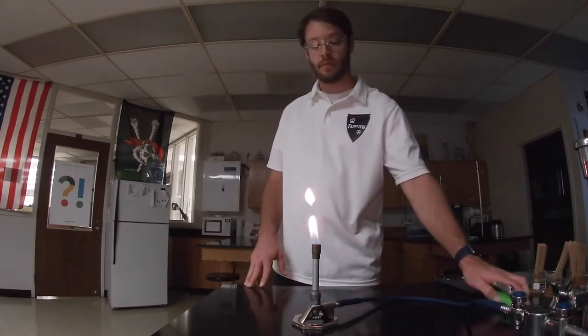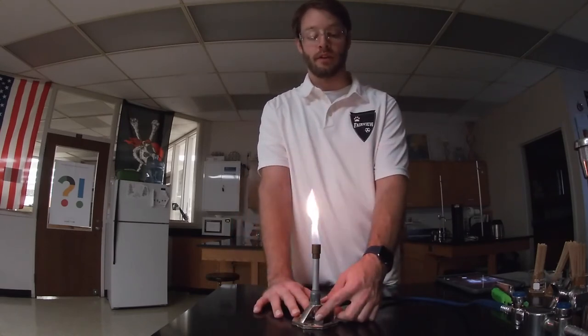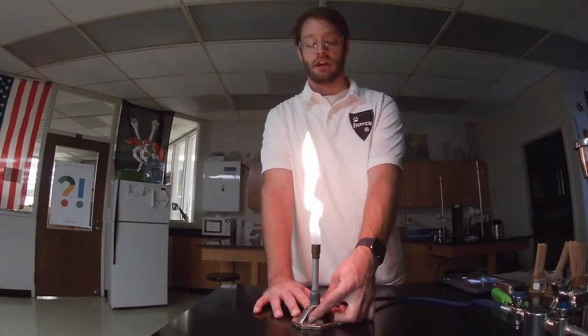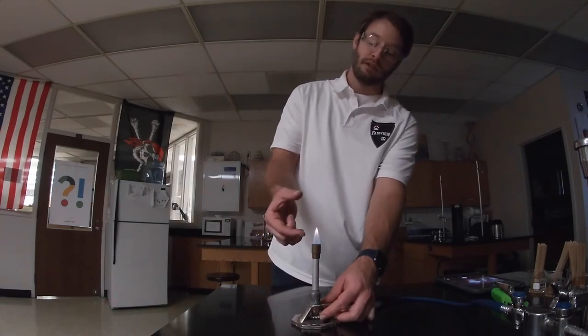They can be very easily blown out or blown around — I just blew that out, so I'm going to relight it. I can adjust the flame size by adjusting the gas valve at the bottom. If I open it, I get a bigger flame; if I close it, I get a smaller flame. I want to start with a flame that's just a few inches tall.